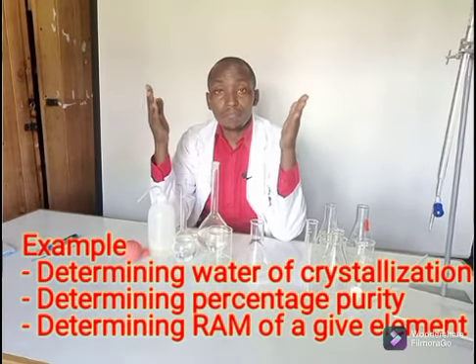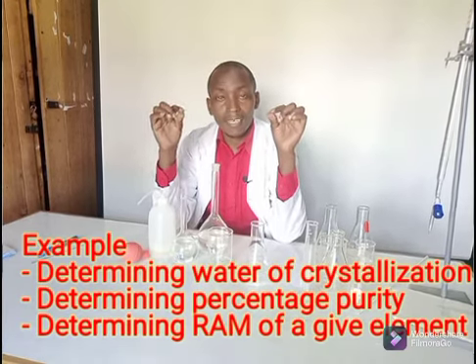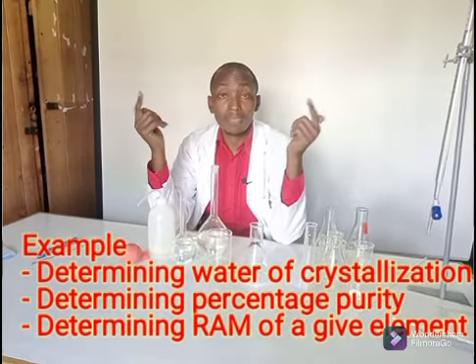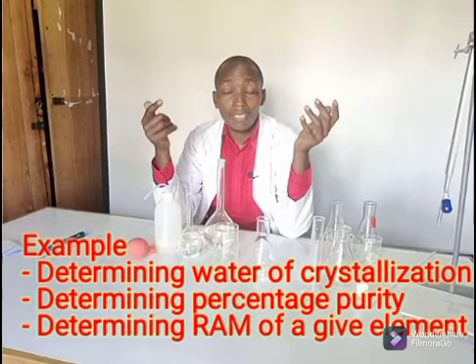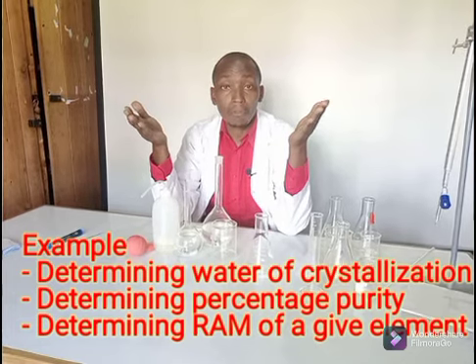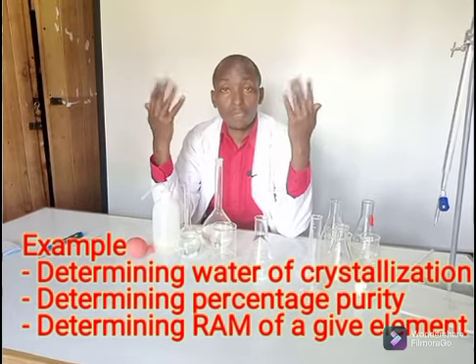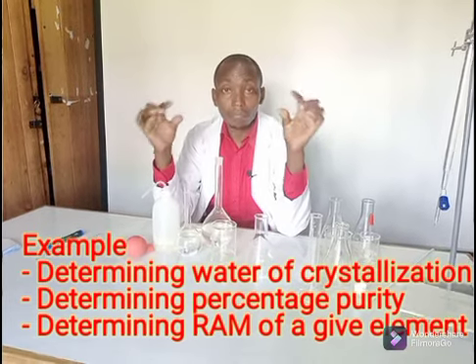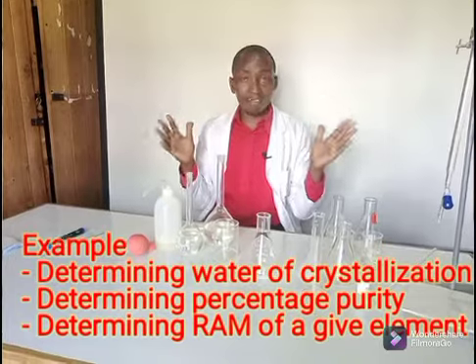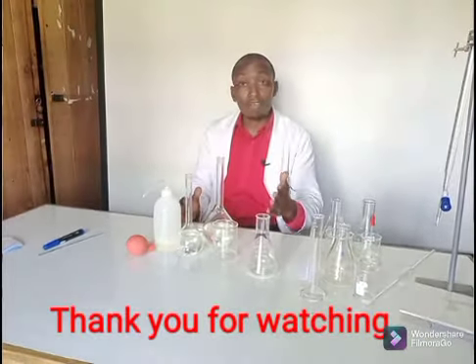So therefore, do not fear titration. Keep trying it, especially the calculations. And the table gives you some free marks. Remember, like what I described before, you need to get the marks for uniform decimals, the mark for a complete table, the mark for the principle of averaging, and of course the accuracy and the final accuracy. Those are free marks for you. So back titration, another very good titration for a Form 3 student and even a Form 4.